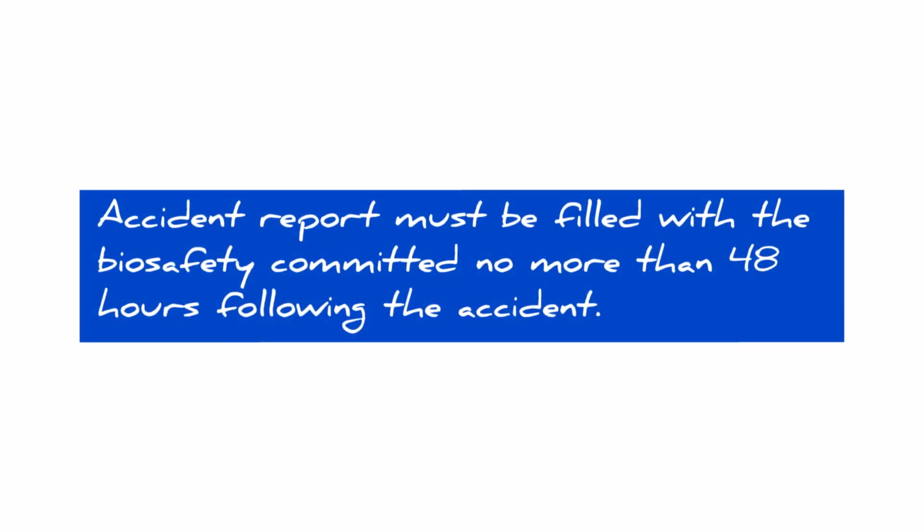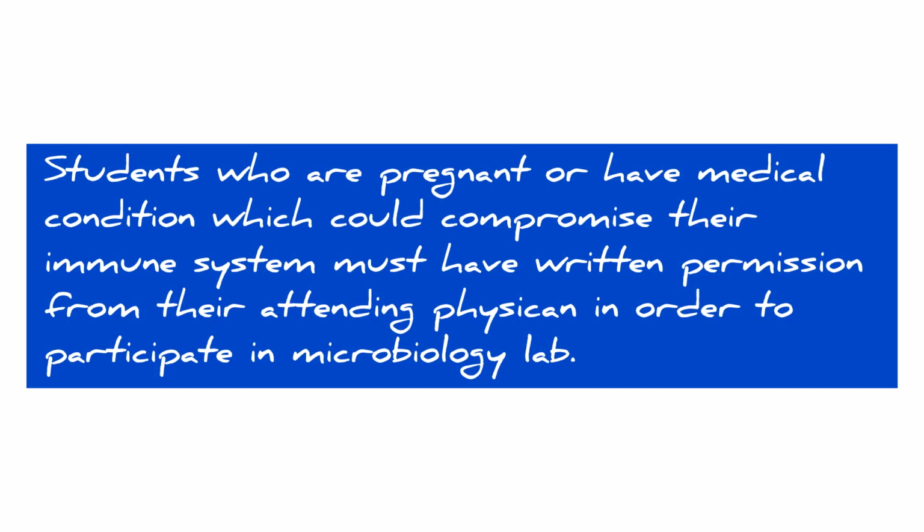Rule number 13. An accident report must be filed with the Biosafety Committee no more than 48 hours following the accident. Rule number 14. Students who are pregnant or have a medical condition which could compromise their immune system must have written permission from their attending physician in order to participate in the microbiology lab.